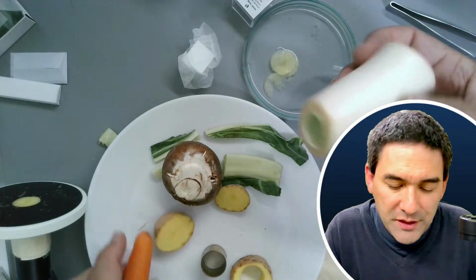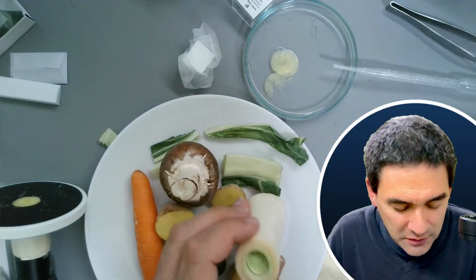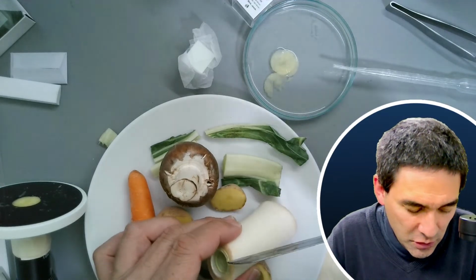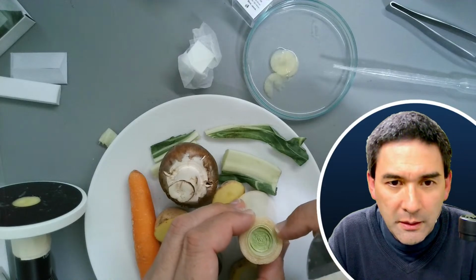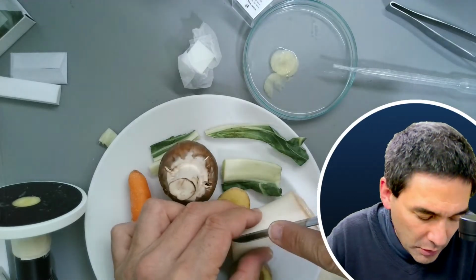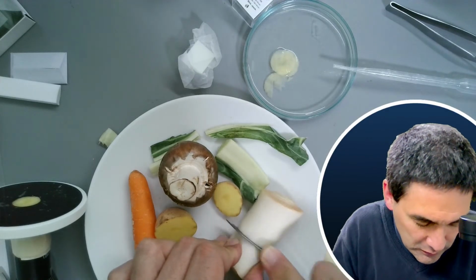So I've got this here. This is from a vegetable soup. I would like to take a small part of this and put it under the microtome, but this is too small. I'm just going to cut it like this, just to show you.